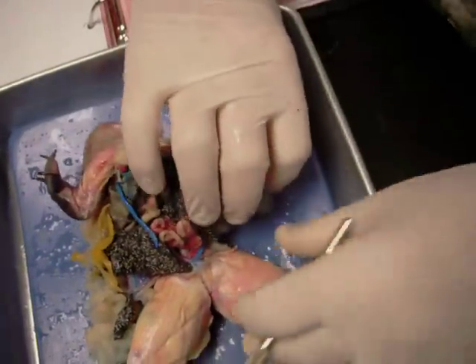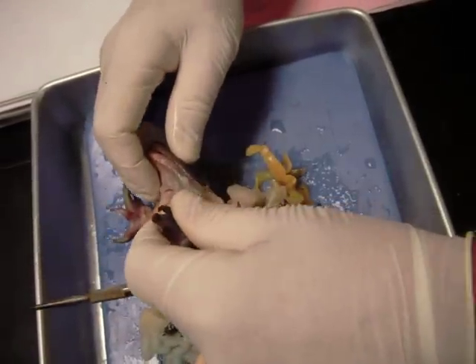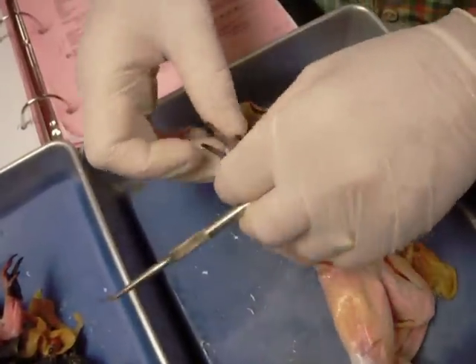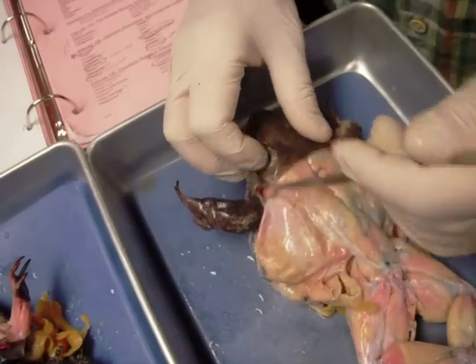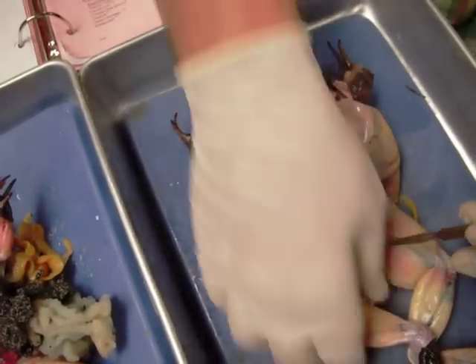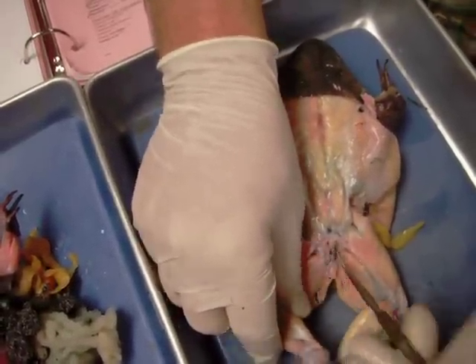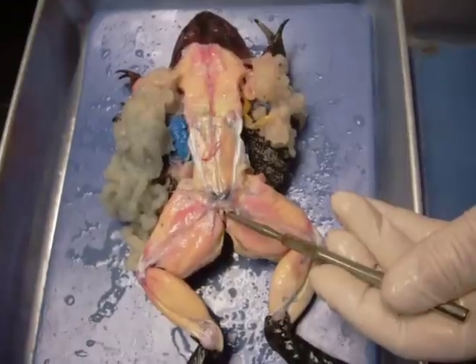The posterior opening of the digestive tract — the terminus of the digestive tract as it were — is the cloaca. We'll go back to the female because hers is easier to find. That's the common opening to the reproductive, excretory, and digestive tracts, and that's the cloaca.